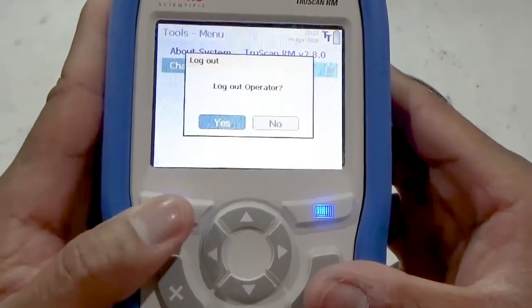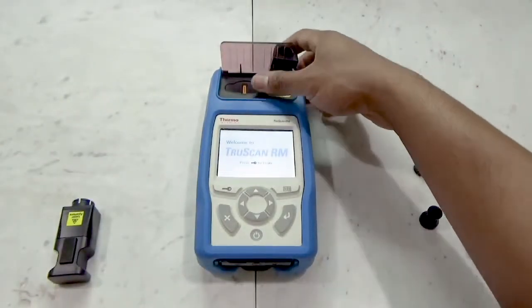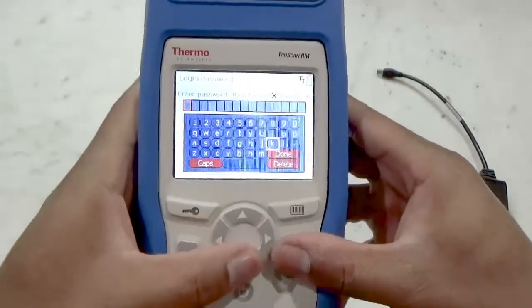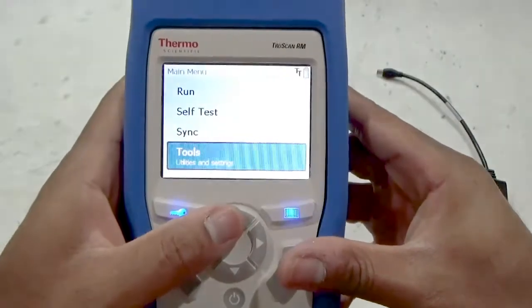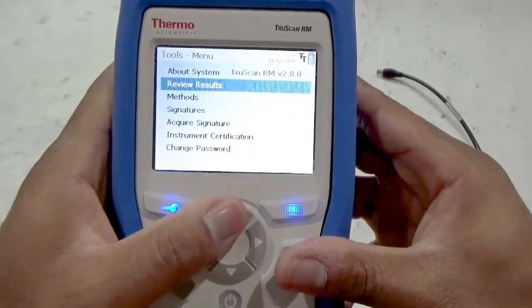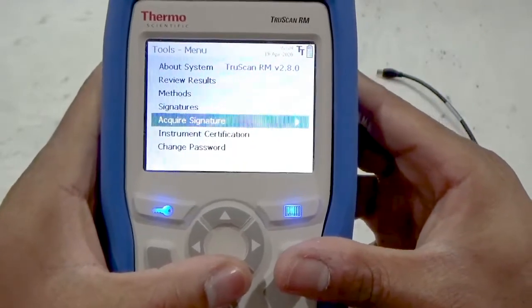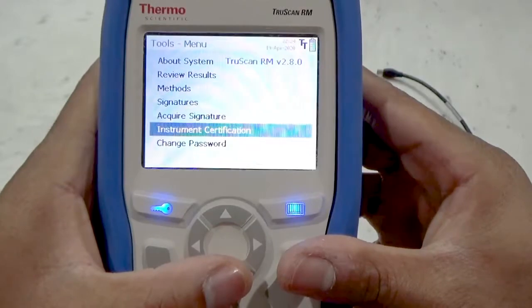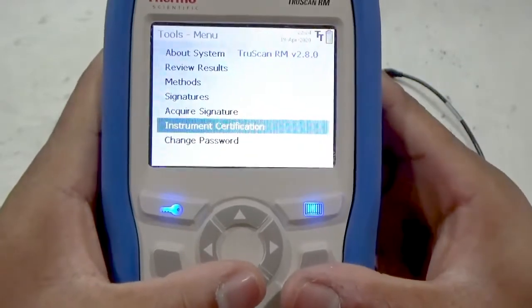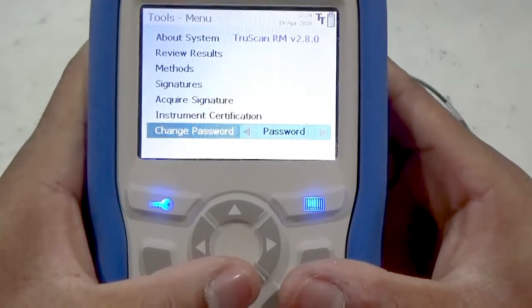Press the logout button and select yes to log out of the instrument. Logging back in as a developer, we can see that this account level has the same run, self-test, and sync functions as an operator, but with greater tools menu options. A developer may review results on the instrument, as well as review what ID methods and signatures are currently on the instrument. The developer can acquire new signatures to develop new methods, and may also perform the yearly instrument certification tests to verify the analyzer is operating within compendial guidance. Just like the operator, the developer may change their password and view information about the system.